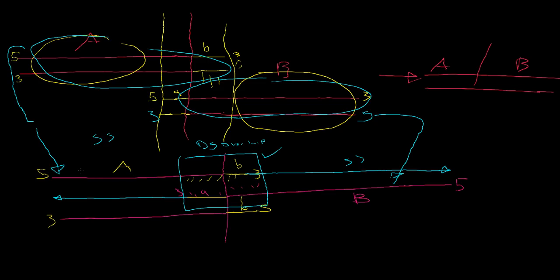So in order to amplify it, what we would be doing, let me just grab a new color. Let's go with, how about green. In order to amplify this, we're just going to go and throw in some new oligos. So a forward oligo that binds to A, and a reverse oligo that binds to B. And this will amplify the products of the reaction.